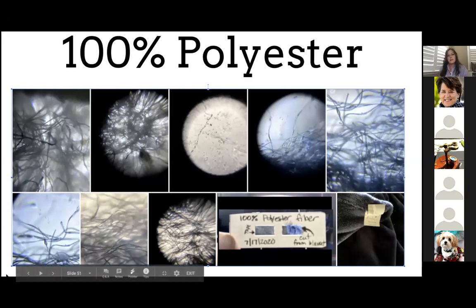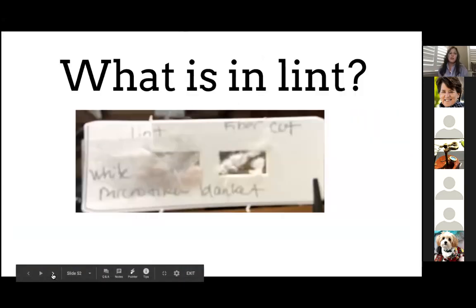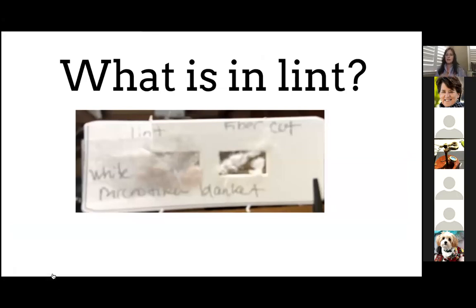I don't have any formal lessons written now with the microfibers, but I'm definitely working on that for next school year, because I think this would be a good way to tie in some things that kids could do with distance learning before we get the okay to return to face-to-face instruction. Even though I don't have a way to capture my washing machine water, I do have lint that comes from the dryer, and we all have that.